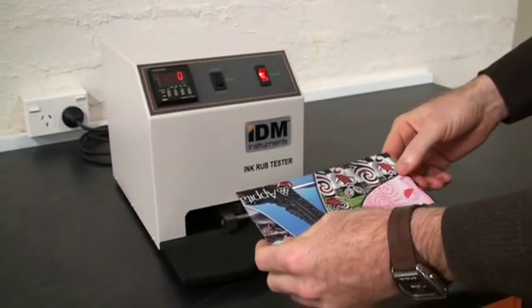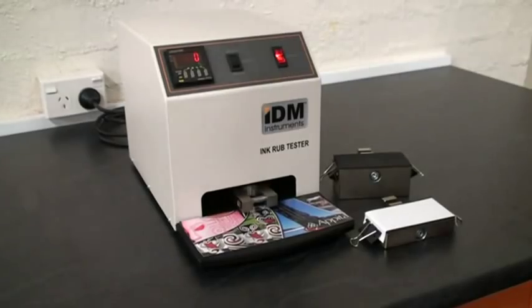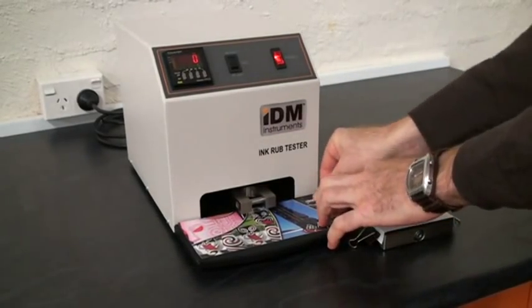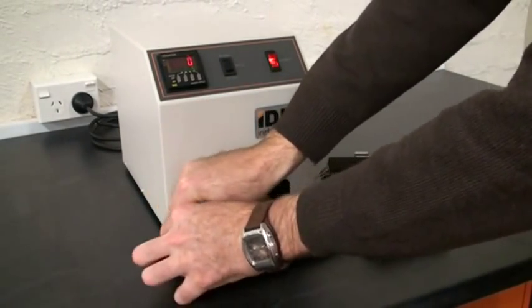We have a sample here already cut out. This is placed onto the rubber pad. We use the 2 pound weight and 2 pieces of tape to hold that in position during the test — one on each end.